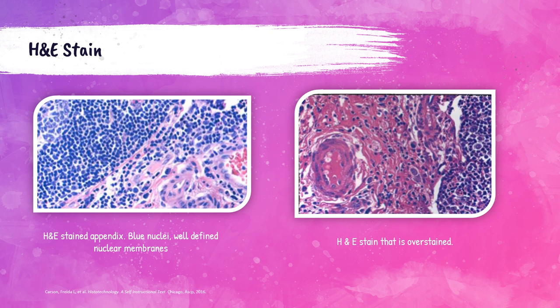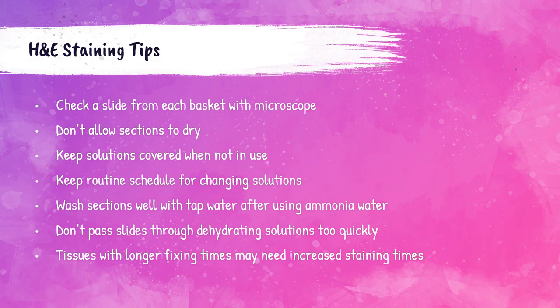The left-hand photo shows a properly stained H&E appendix section — blue nuclei with well-defined nuclear membranes. The right-hand photo shows the same specimen overstained, with loss of differentiation between non-nuclear elements and poor contrast between nuclei and cytoplasm. Following staining, one slide from each basket should be checked under the microscope to ensure proper staining. If using an automated stainer, a control slide should be stained to ensure it is working properly.